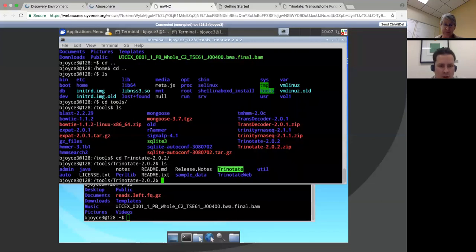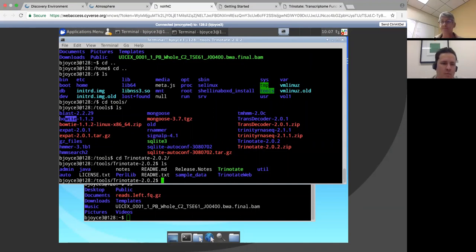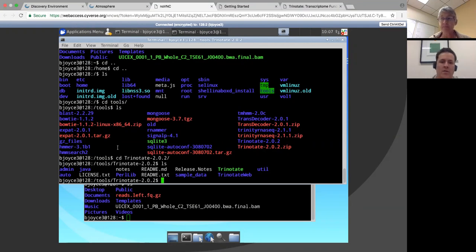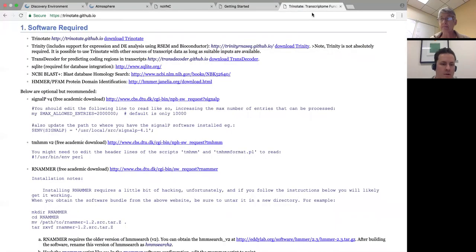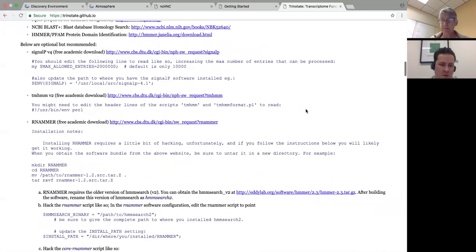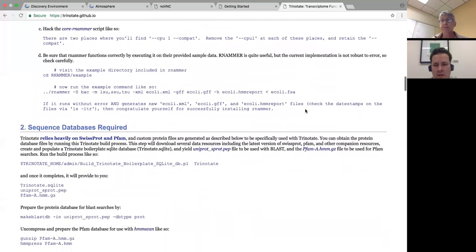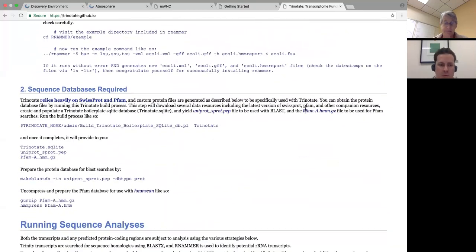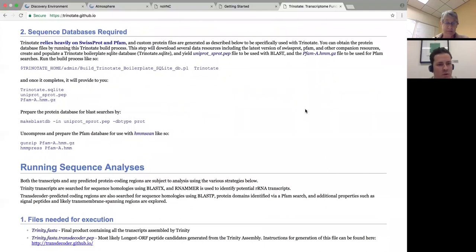You can see we've already got HMMER installed, SignalP installed, SQLite installed, Bowtie, BLAST, and HMMER — all of those tools that go together to make Trinotate. We've already installed them, configured them, and set them up, so you can completely skip that first step. That's one of the advantages of using platforms like Atmosphere: once somebody configures it and saves that image, no one else has to go through and change all of that stuff.